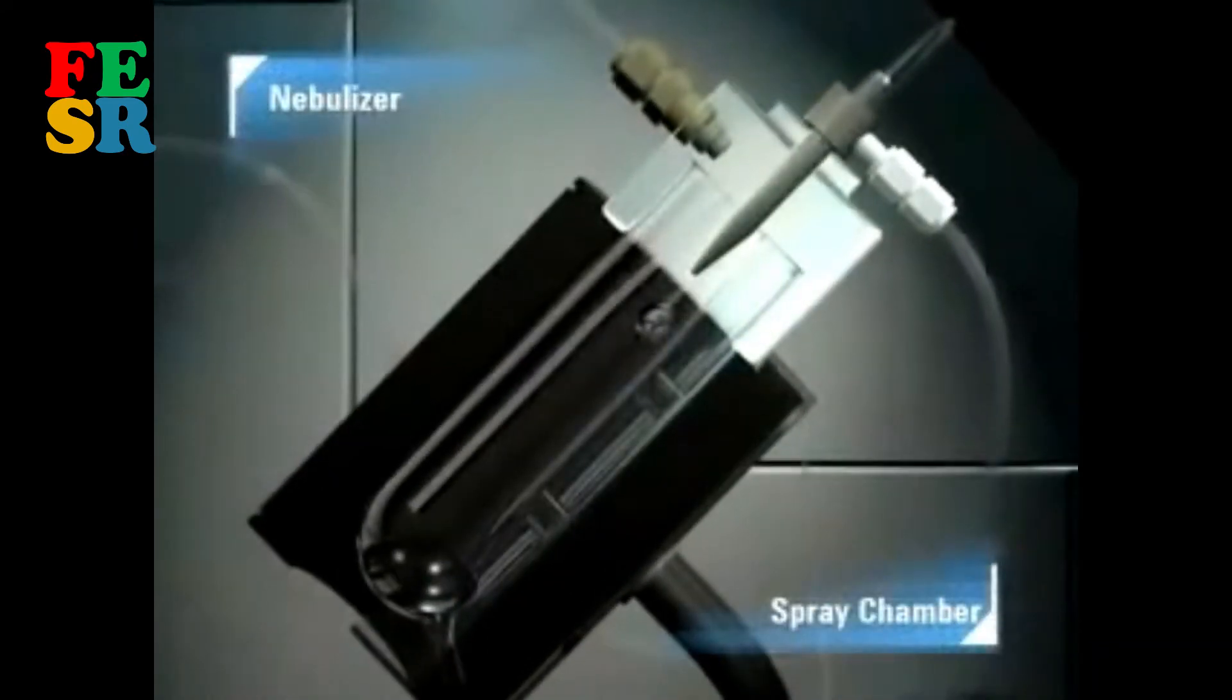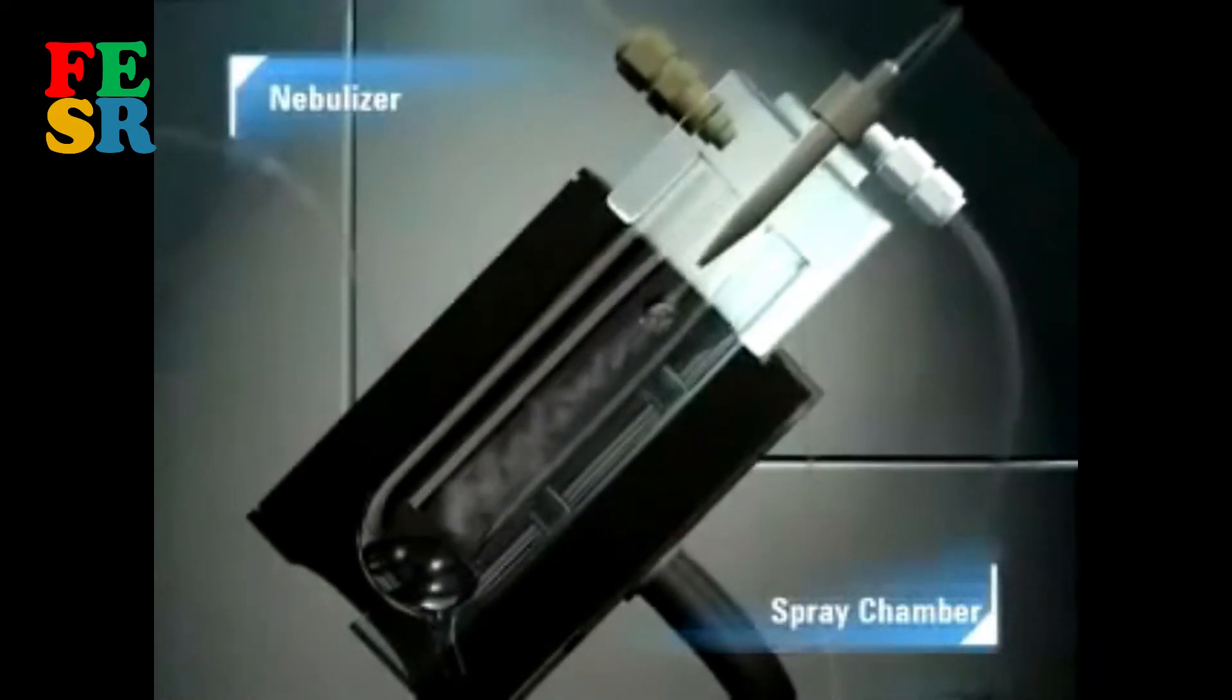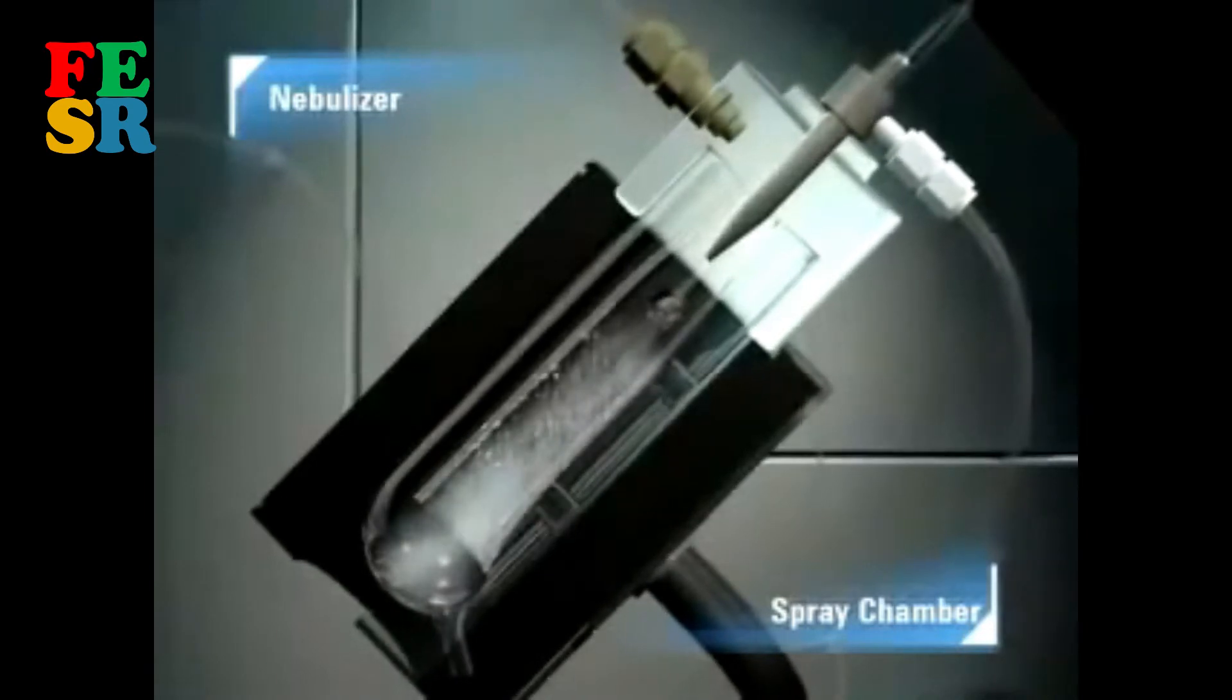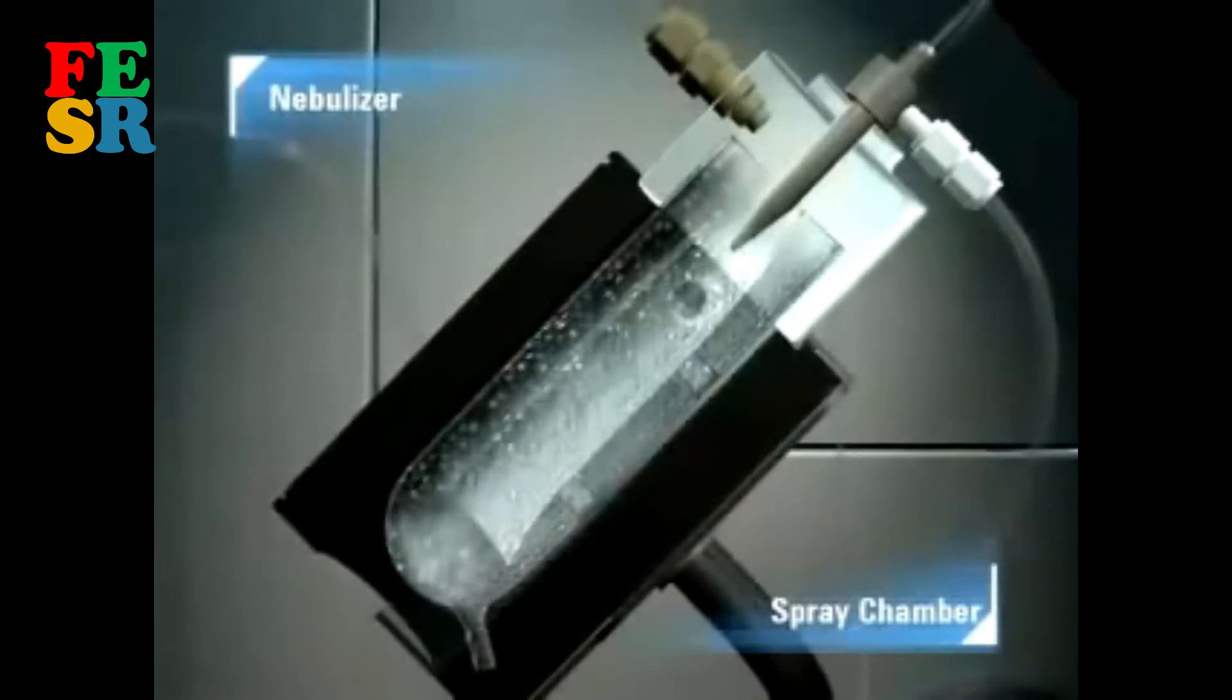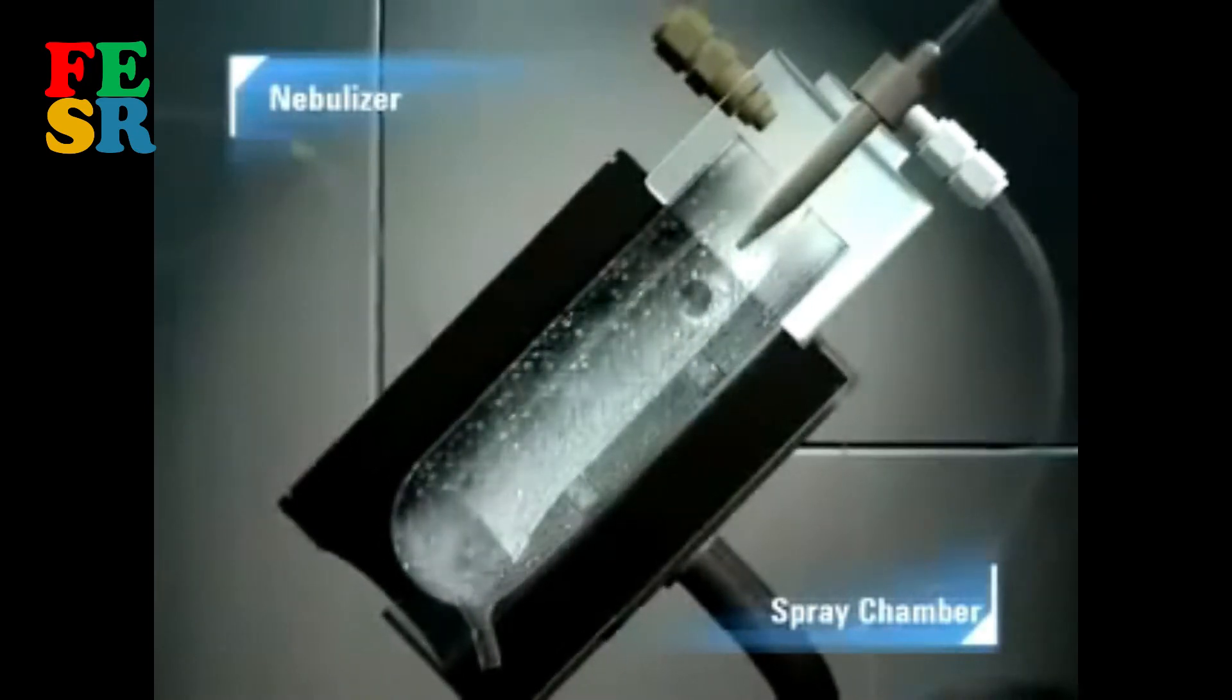Let's follow the journey a sample takes from its sample vial through the ICP-MS to the detector. Sample is pumped from the sample vial into the nebulizer, where it is mixed with argon gas to form an aerosol.